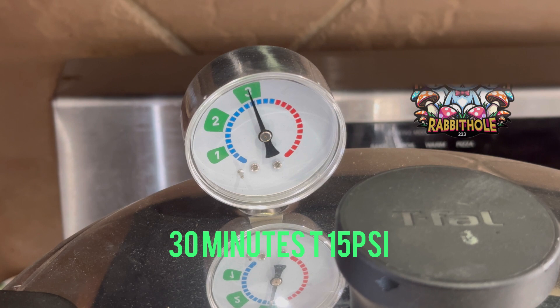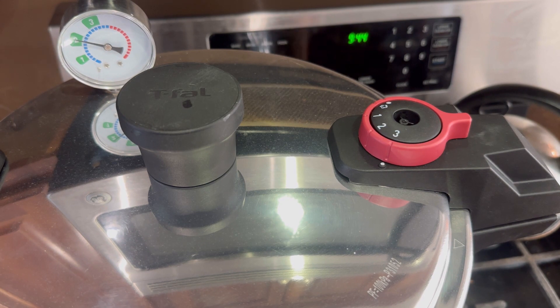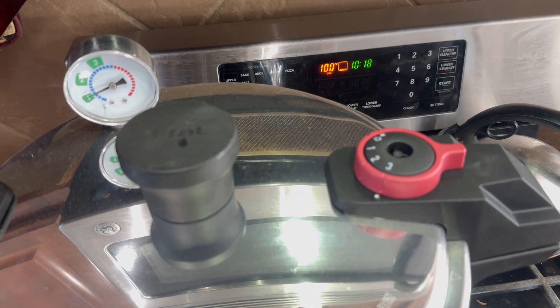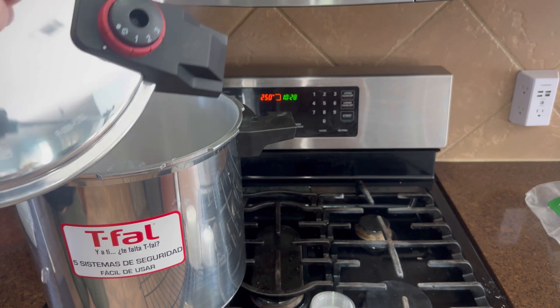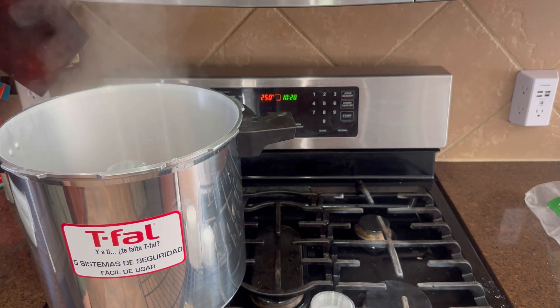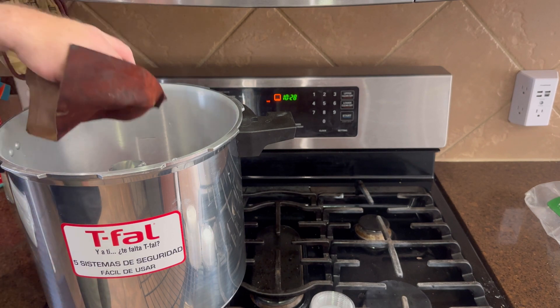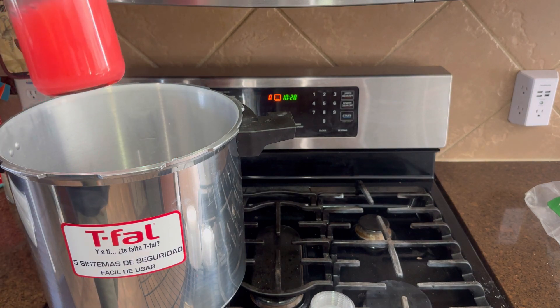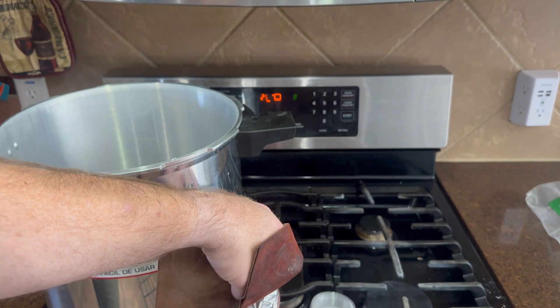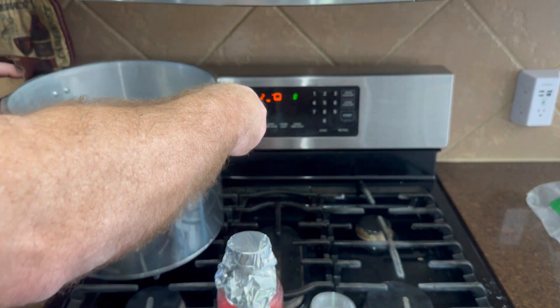Cook it at 15 PSI for 30 minutes, then turn it off and let it cool — I think it only took about 20 minutes to cool down. I walked away for 30 minutes while it was going, set a timer, came back, turned it off, then set another timer for 20 minutes. It's nice and hot when you pull it out, so make sure you use something to protect your hand. At this stage if you poured it directly into your ketchup cups it would melt them, so you have to let it cool down.